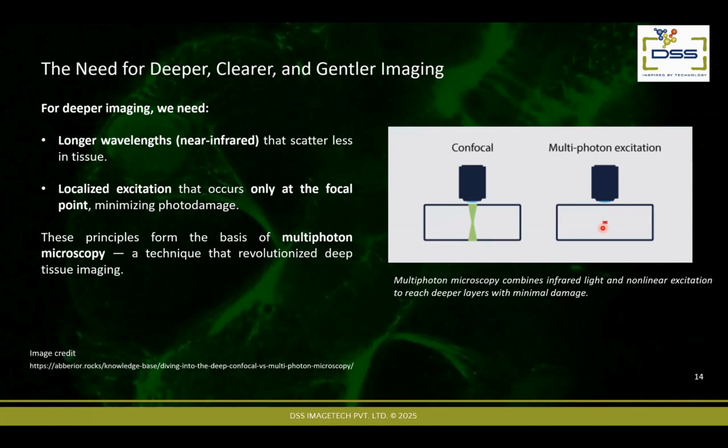So only the focal plane where we are currently imaging, only that focal plane is then illuminated with the light. And that is why we illuminate one optical section, we collect light only from that optical section. We don't need a pinhole. And also that is the reason why we are not having photobleaching, because we are only illuminating a single spot, not the entire specimen.